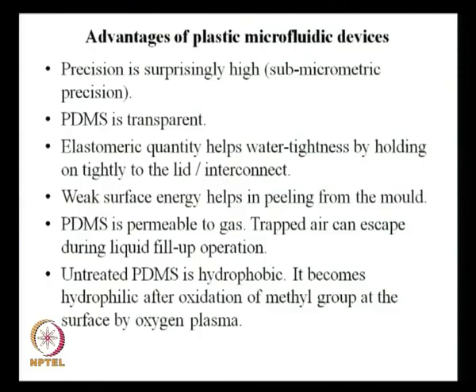The next point is PDMS is permeable to gas, so trapped air can escape during liquid fill up operation. This PDMS material can permeate a gas. When you start working with your device, suppose you fill the channel with a liquid and the channel is occupying some air. Either you have to apply vacuum so that air comes out and liquid gets in, so you have to make some arrangement to have the liquid penetrate into the channel.